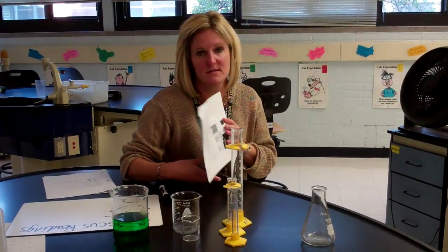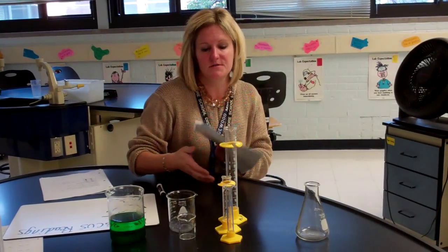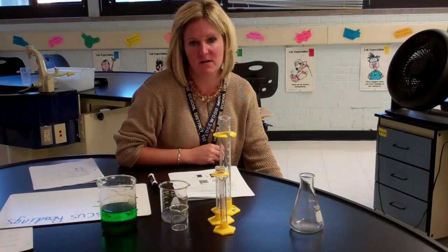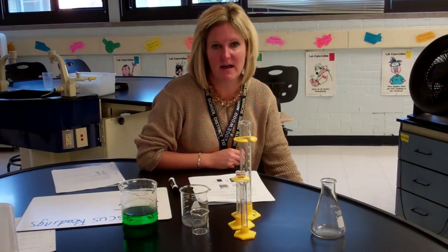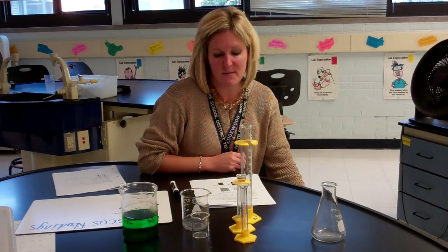Today we're going to discuss, in your measurement skills packet, the measurement metric of volume using the base unit of liters. So just to go over on your sheet, once again, volume is the amount of space that something occupies. It could be a solid or it could be a liquid. Usually it's a liquid that we utilize in science, whether we're measuring chemicals, water, or something else.